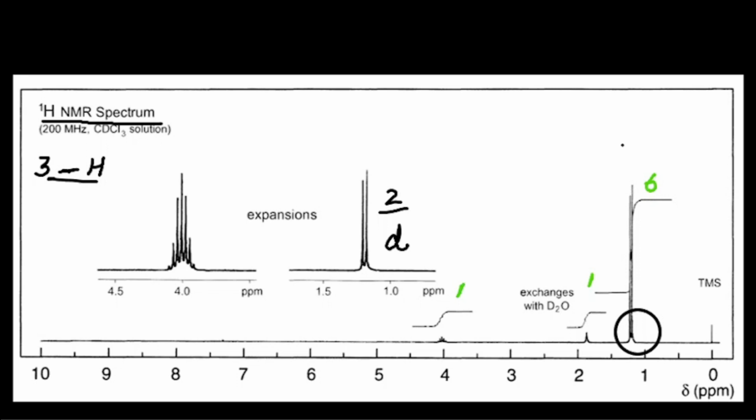It means how we will arrange these 6 hydrogen atoms. We can arrange it like this: CH3 and CH3. And in its neighboring, it is attached with only one hydrogen, like this. Whether it is correct or not, we may conclude from this. If you see here, this is almost 1.2 ppm value. So it may be possible here that the methyl group is present.